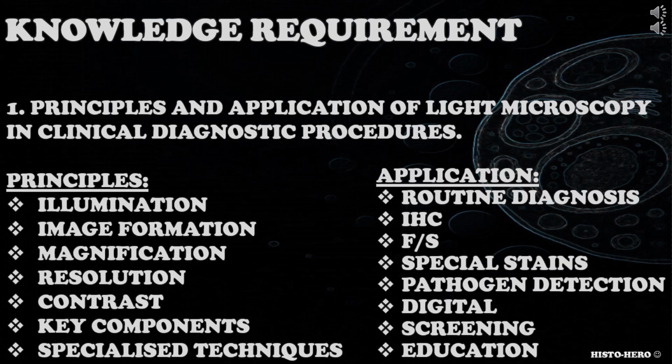histopathology. When addressing this knowledge requirement, candidates should consider illumination, magnification, image formation, working parts of microscope like light source, condenser, diaphragm, objective, eyepiece, or stage, special techniques like bright field, dark field, phase contrast, differential interference contrast, fluorescence, confocal, or polarized, applications for routine diagnosis, IHC, and special stains review, screening, intraoperative assessment of F/S, digital pathology.